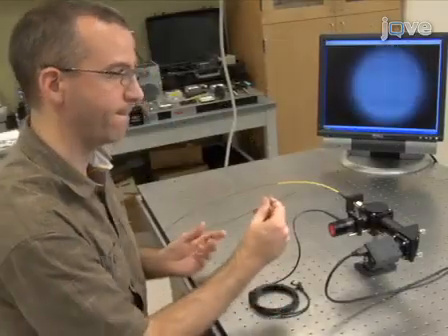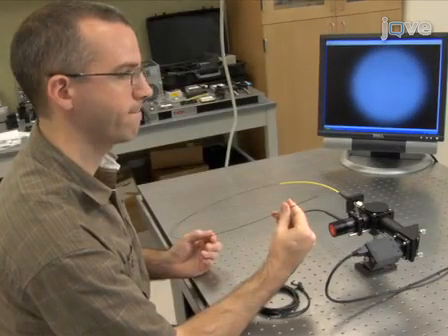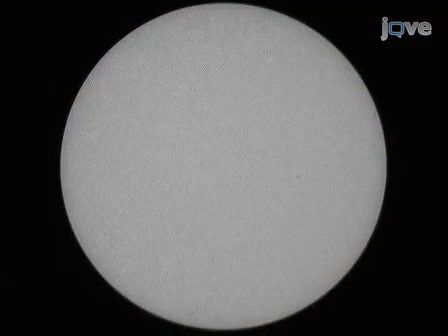Direct the distal end of the bundle towards a broadband light source. Fluorescent lighting will suffice. Then, observe the image of the bundle proximal face on the CCD camera. Finally, adjust the position of the objective lens by screwing in or out of the cage cube until the fiber bundle image appears in focus. The individual cores should be clearly visible.